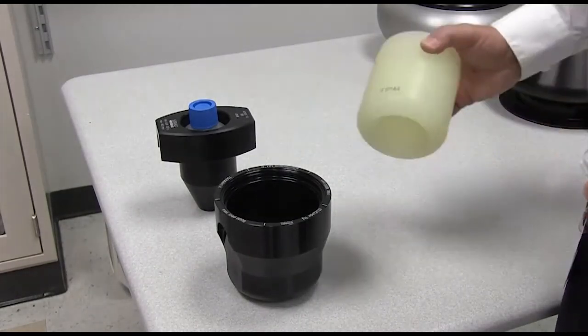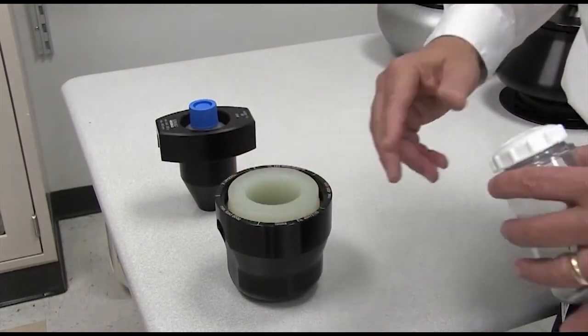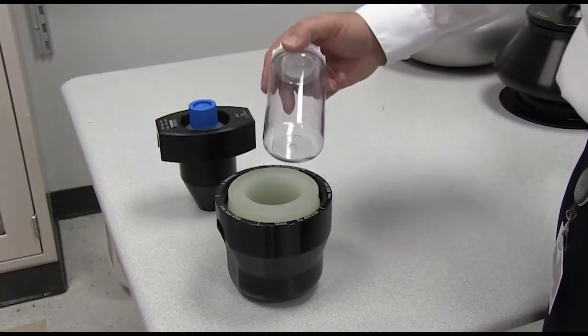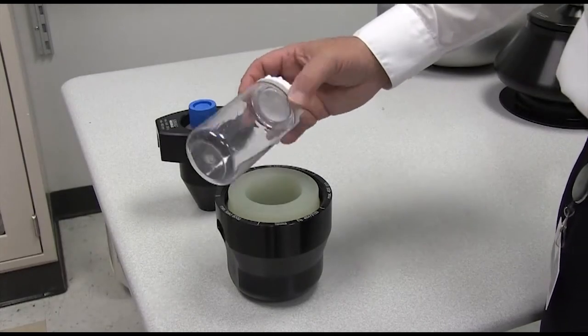And I've just included one particular adapter here to show you a centrifuge bottle. We're not just working with tubes. We just saw the conical centrifuge bottles.